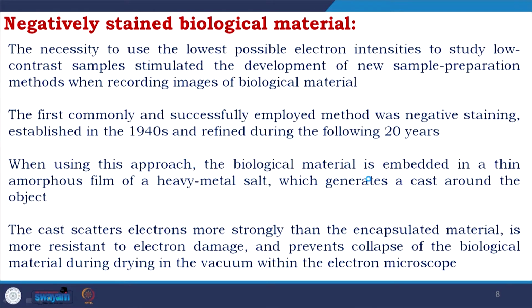When using this approach, the biological material is embedded in a thin amorphous film of a heavy metal salt, which generates a cast around the object. The cast scatters electrons more strongly than the encapsulated material, is more resistant to electron damage, and prevents collapse of the biological material during drying in the vacuum within the electron microscope.